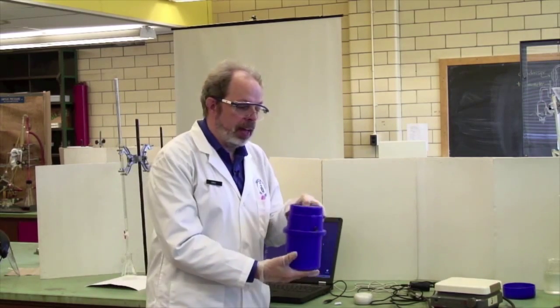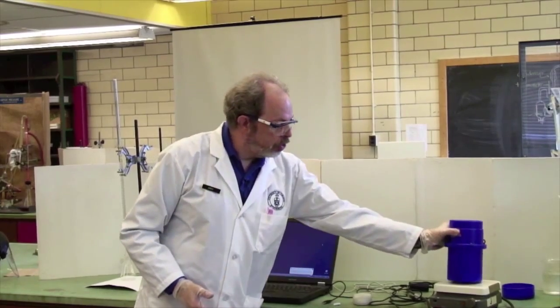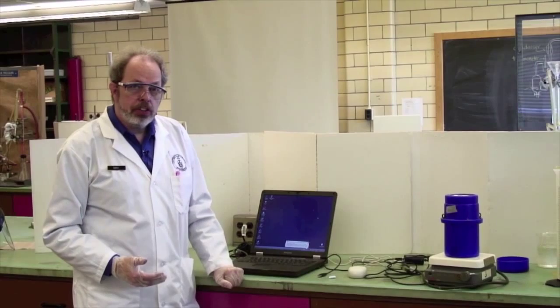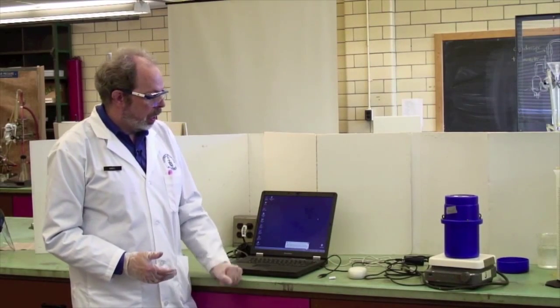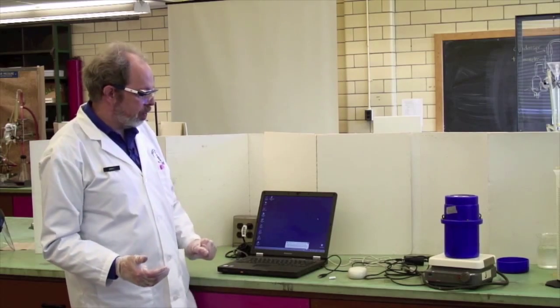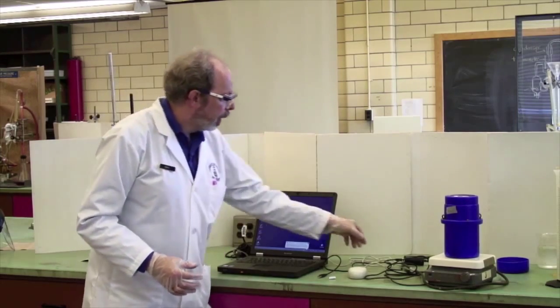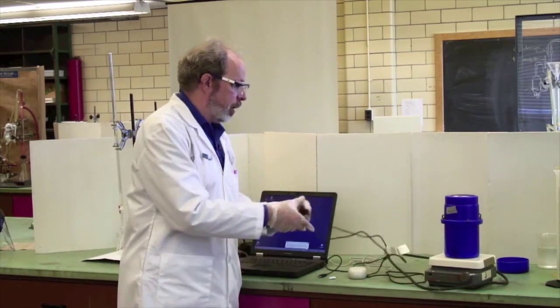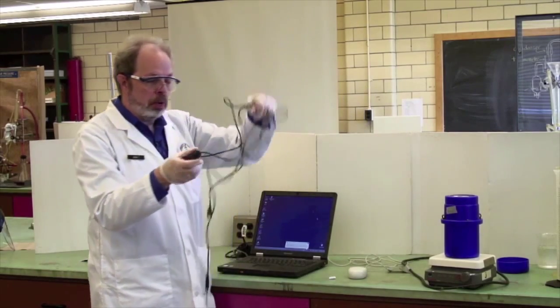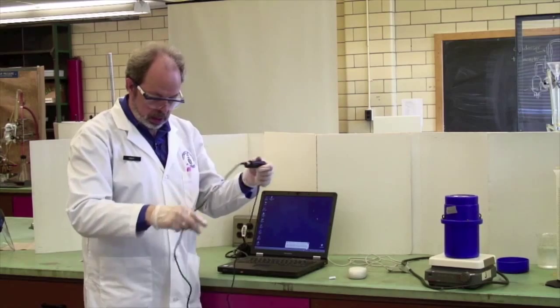The calorimeter is a dewar flask or thermos flask. It sits here and should sit on top of a stirrer plate. You are monitoring the temperature using a laptop. These are somewhat ancient, they are not quite as old as you, but they are getting on that way.